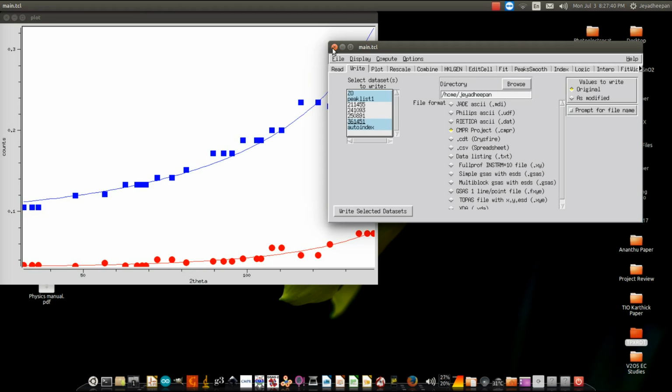So up to this, we have our unit cell parameters, crystal structure, crystal class, the phase present in your compound, and the crystallite size and strain of your crystal structure. So all these details we have right now.